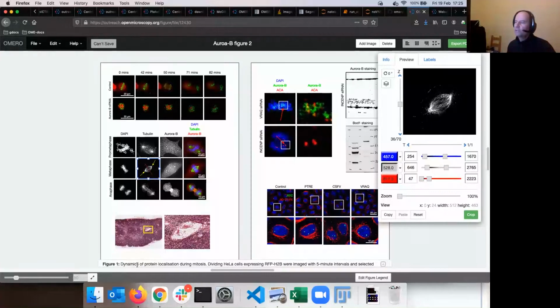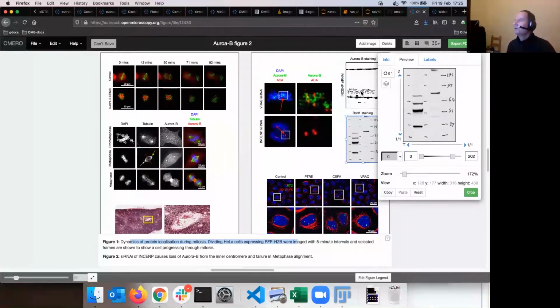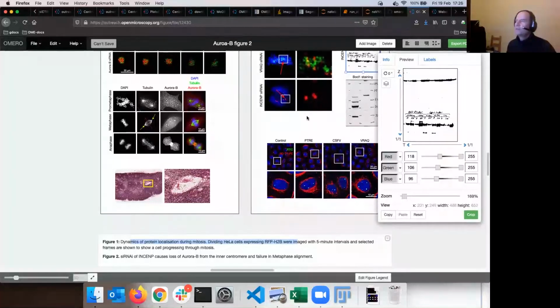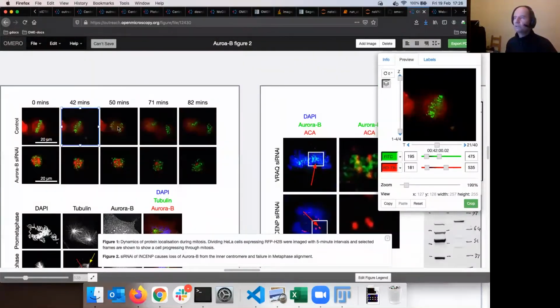You can do a legend for your figure at the bottom. That's all possible. And indeed, if you have your Western blots saved as PNGs and import them as images into OMERO, of course, you can add them to your figure as well. Very good. Now, let me show you something which is very interesting on this particular OMERO figure, and this is the time lapse. This shows in a good manner the power of OMERO.figure.